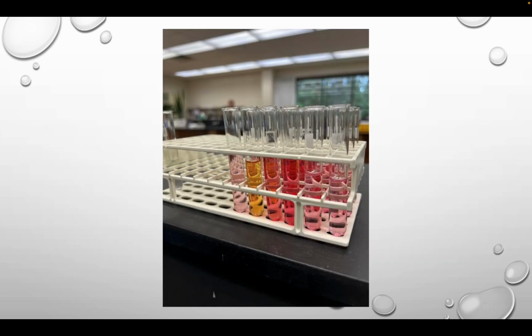After 30 minutes, we poured the sample solutions into cuvettes, and as you can see, there is a variety of coloring and released pigment. This is room temperature, which was 17 degrees. This was 90 degrees, and as you can see, the color changed. This is 0 degrees, 35 degrees, 50 degrees, and 65 degrees.